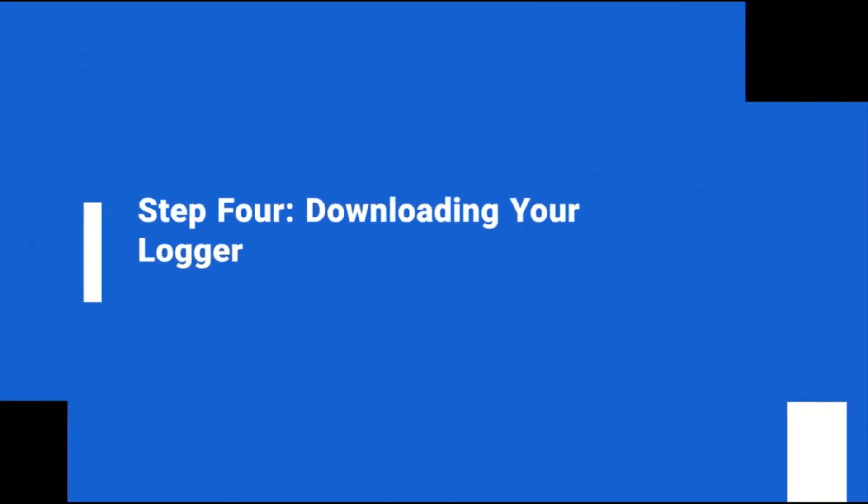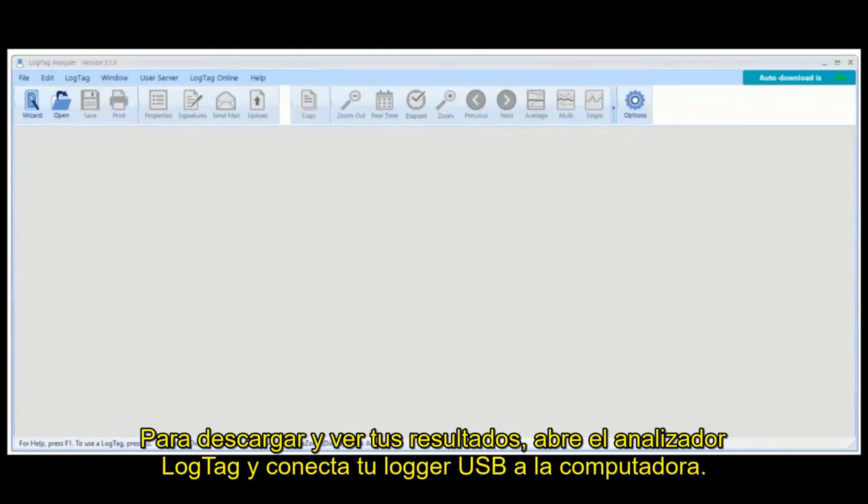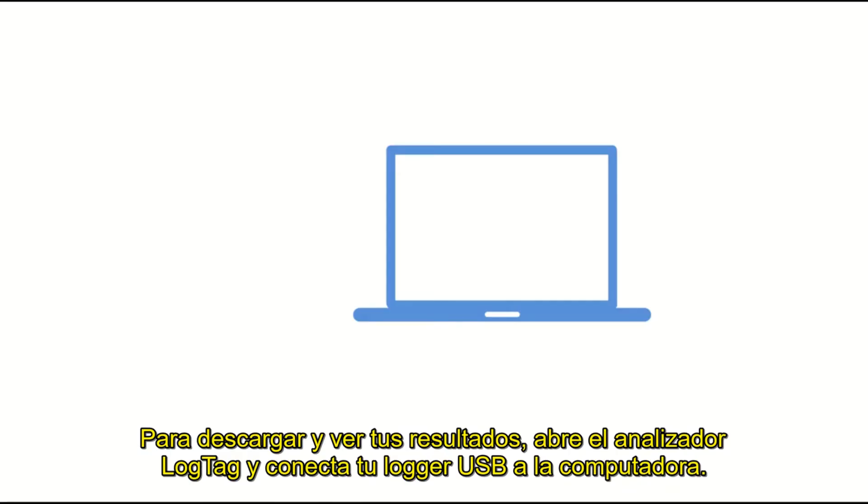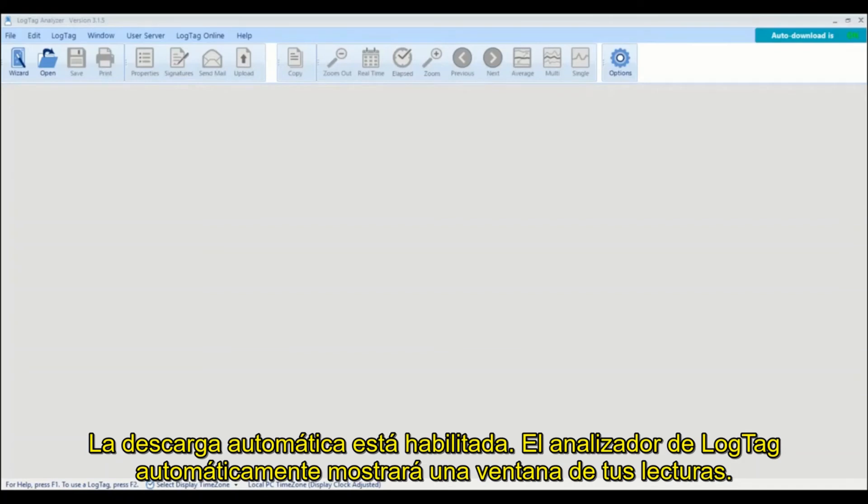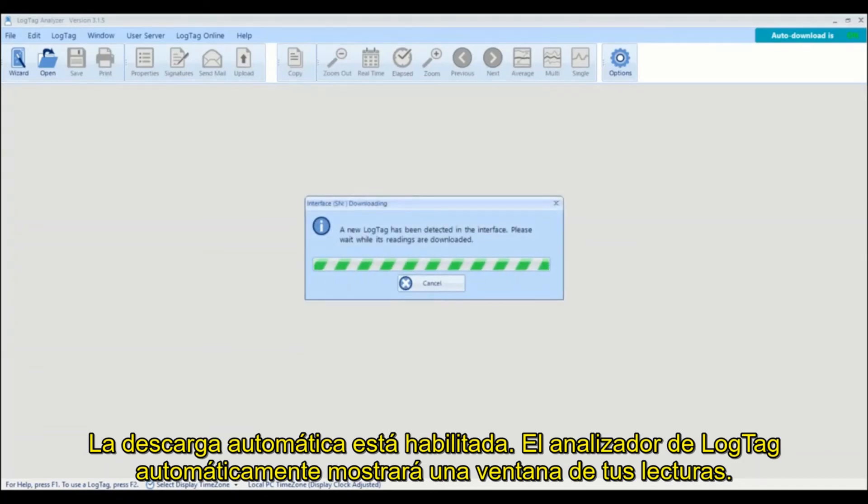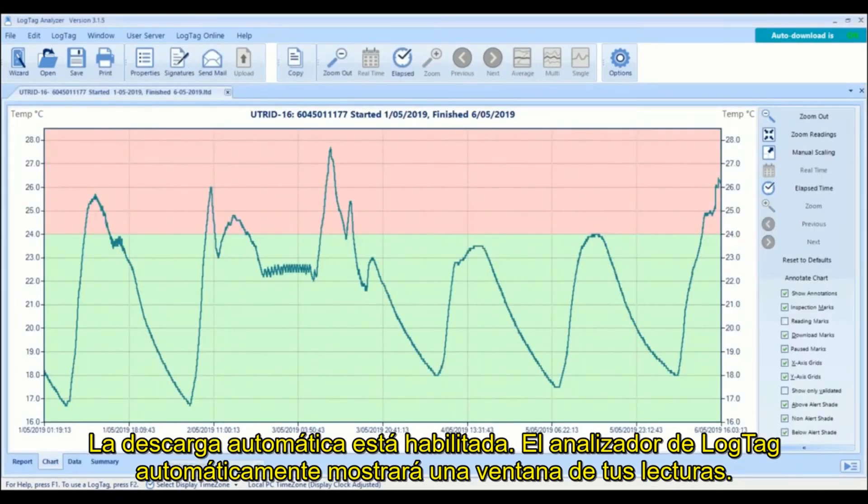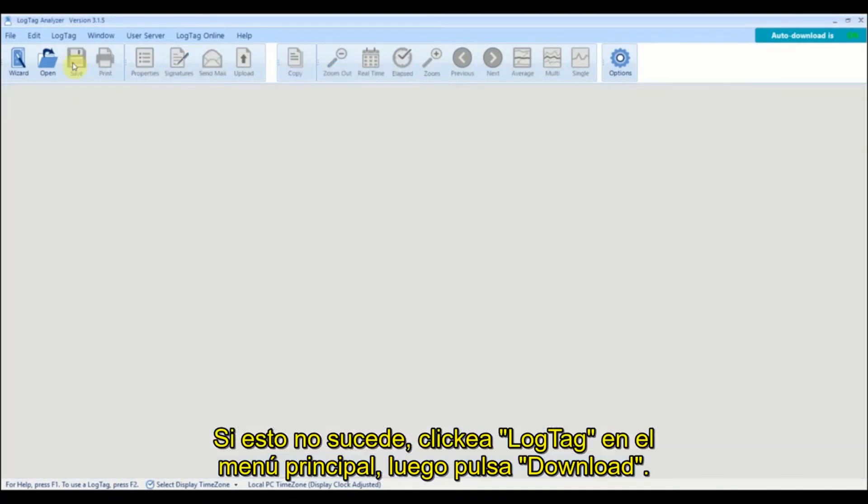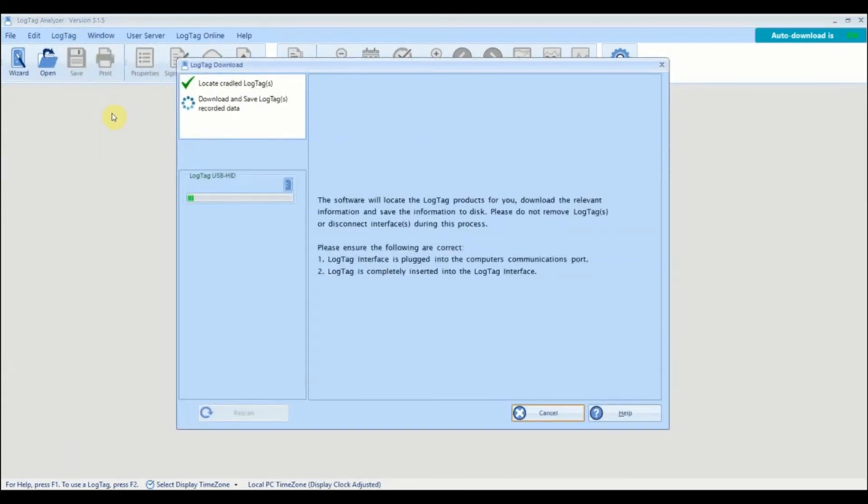To download and view your results open LogTag analyzer then connect your USB logger to your computer. If auto download is enabled LogTag analyzer will automatically display a chart of your readings. If not, click LogTag from the main menu then click download.